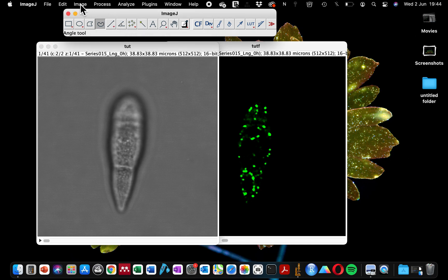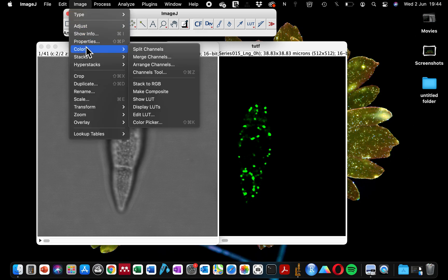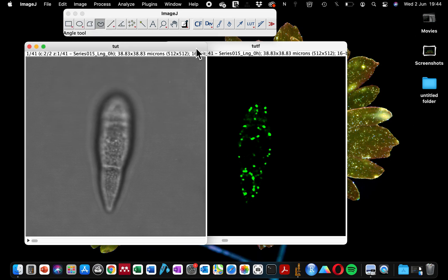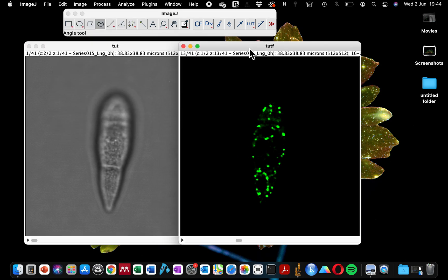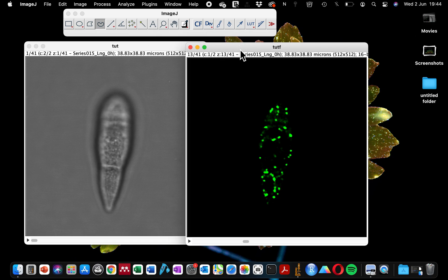The first thing you need to do is go to Image, Color, Split Channels. This will split the different channels into individual channels. If you have three channels together it will split into three, and if you have two channels like I do here, you will have your two different channels in different windows.